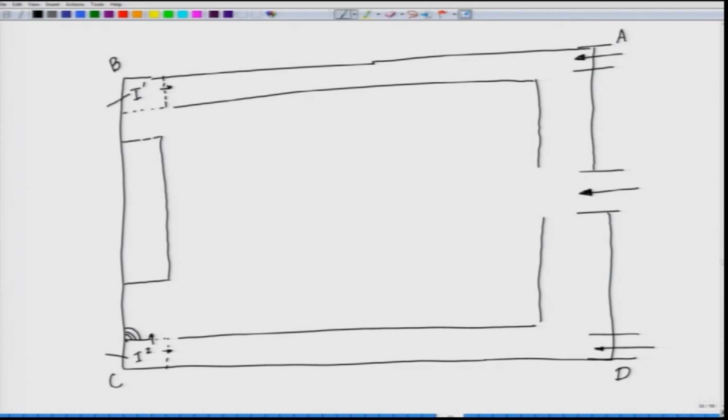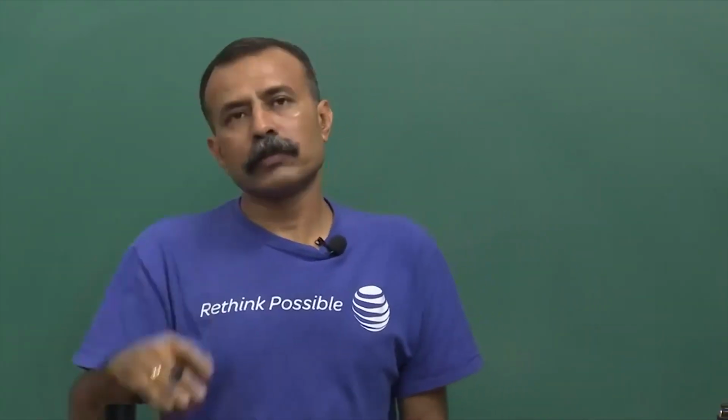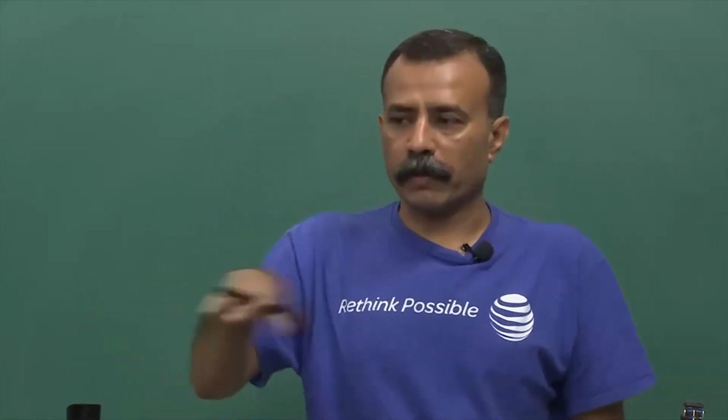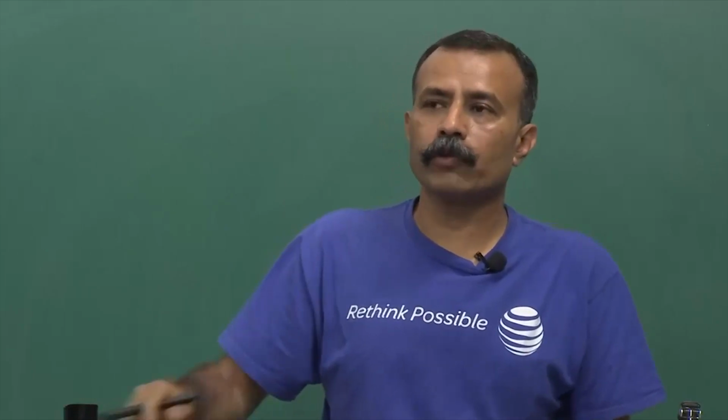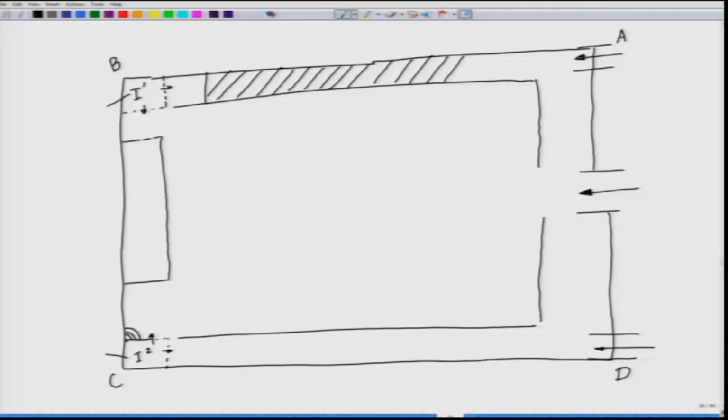So, you have to ensure how much area of the side tables you are going to make, and if you are doing it in India, ensure that the height of the countertops you are developing matches the average Indian height, which is somewhere around 80 centimeters. You should look through it, because sometimes we make those heights pretty tall and it has its own set of issues.